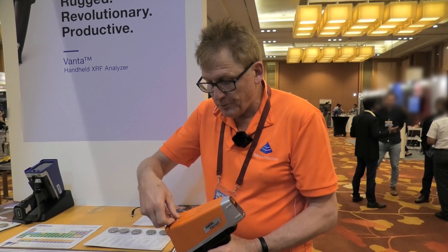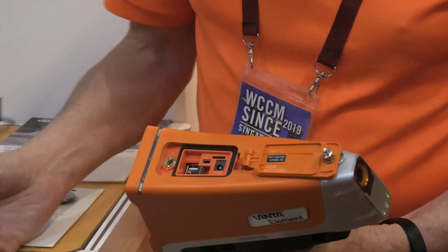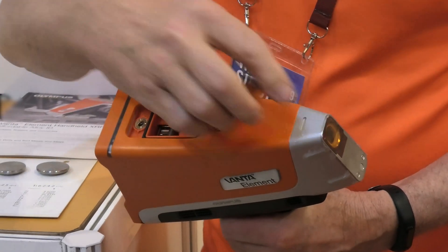To charge it — when you receive it, it should be fully charged. To charge it, you will simply open this little top panel. There's a little charging port there.